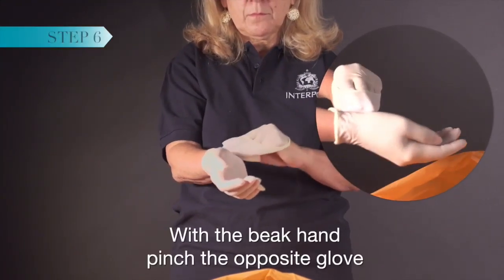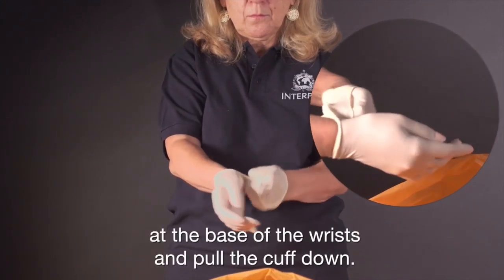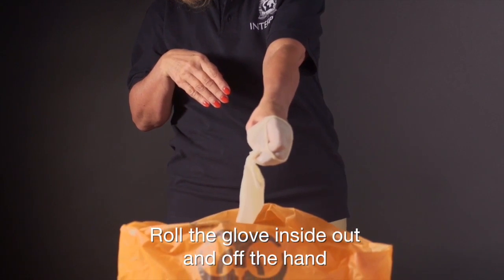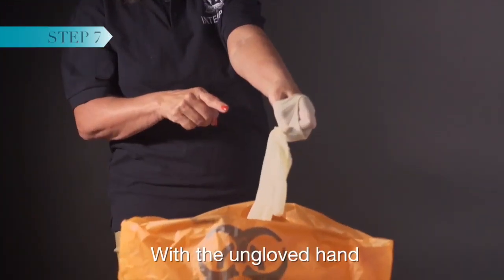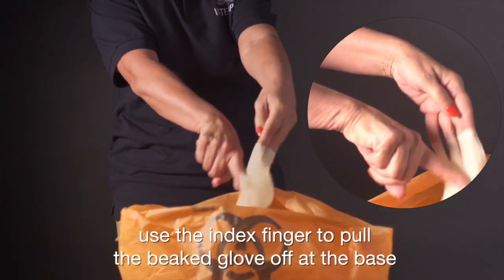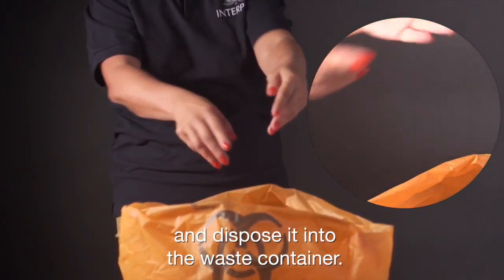With the beak hand, pinch the opposite glove at the base of the wrists and pull the cuff down. Roll the glove inside out and off the hand into the appropriate waste container. With the ungloved hand, use the index finger to pull the beaked glove off at the base and dispose it into the waste container.